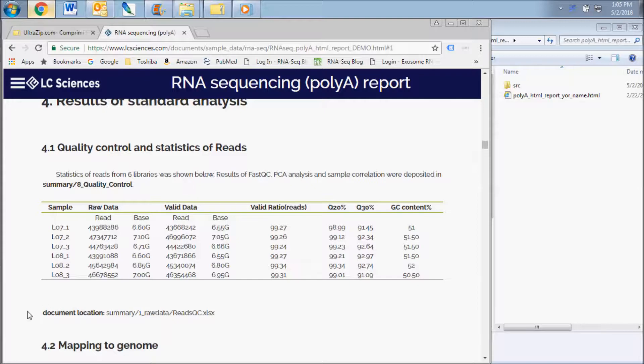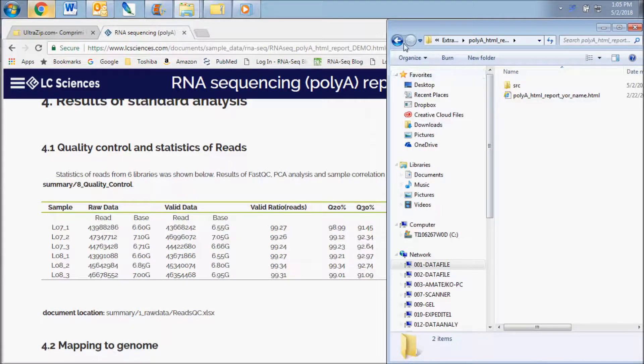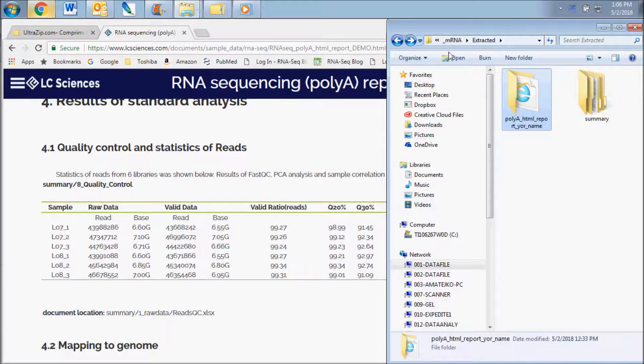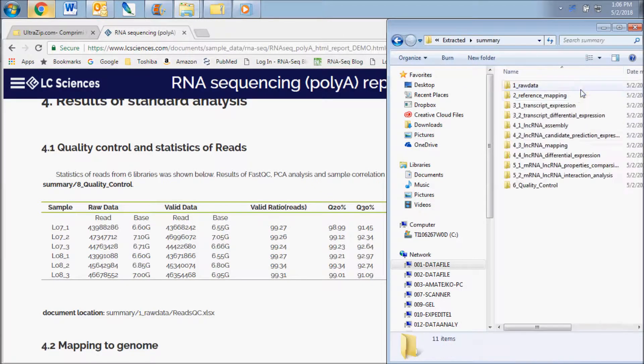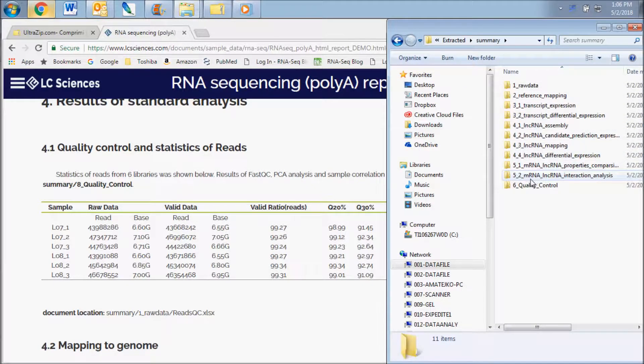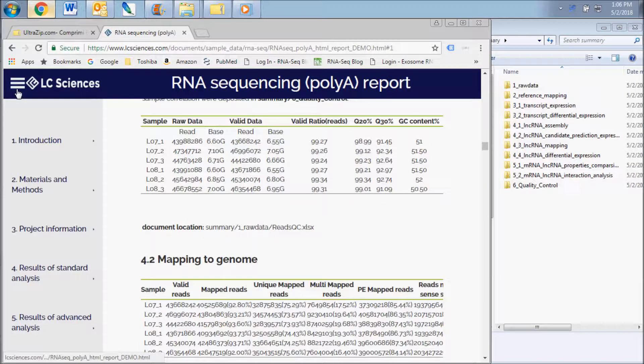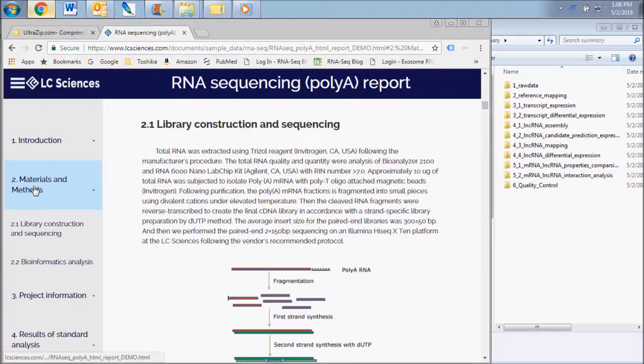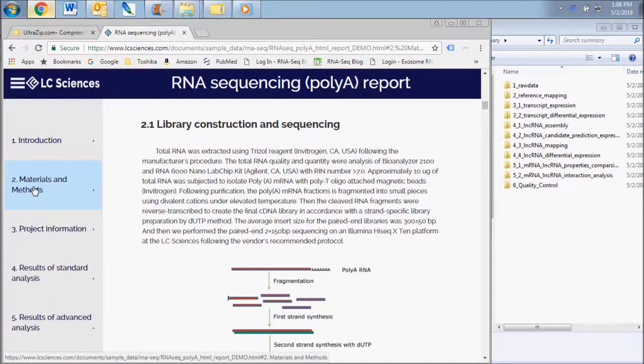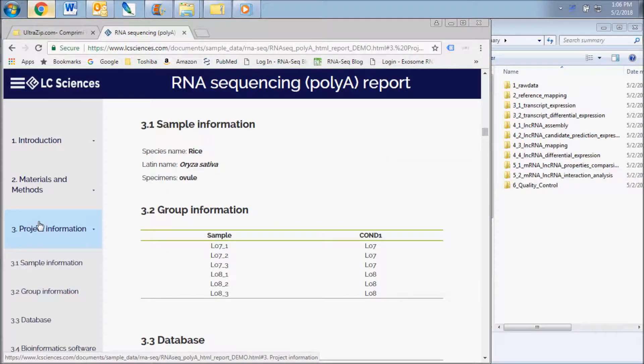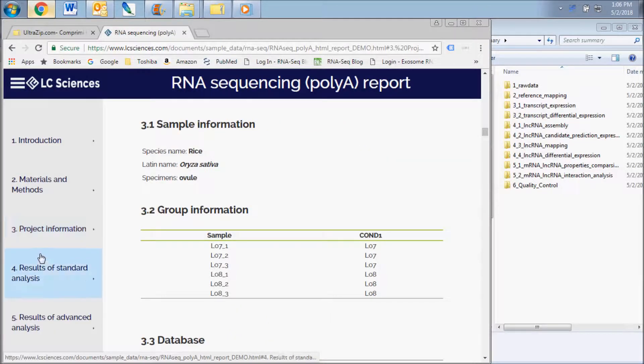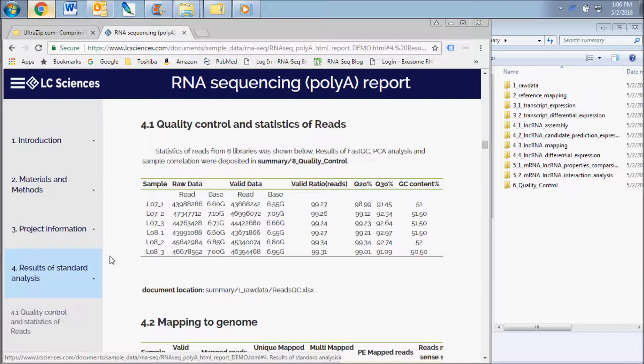At the end of each subsection of this report, you can find the location of the documents in the final report folder that contain the entire dataset. When viewing the HTML file, you can navigate between the sections of the report using the menu on the left side.